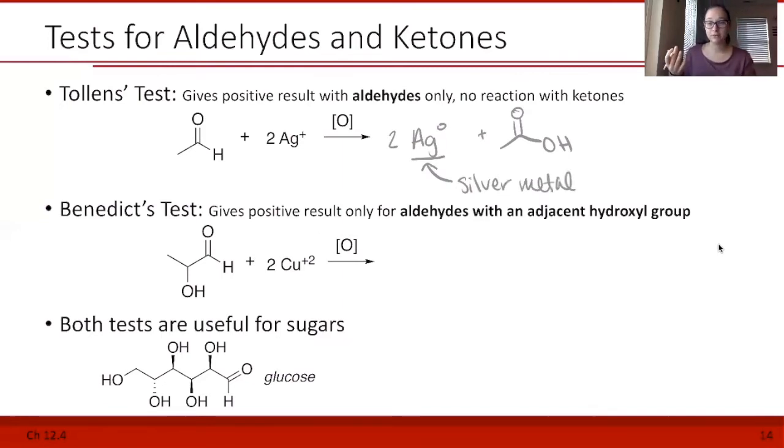And that has that stereotypical shiny metallic look, whereas silver plus doesn't have that metallic look. It's typically like a white powder, honestly. It kind of looks more like salt because you have it mixed with something else. And then when you oxidize the aldehyde, you get silver zero, and it's that silver metal, and you can see a metallic sheen in your reaction.